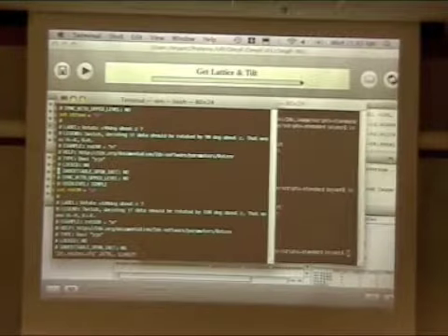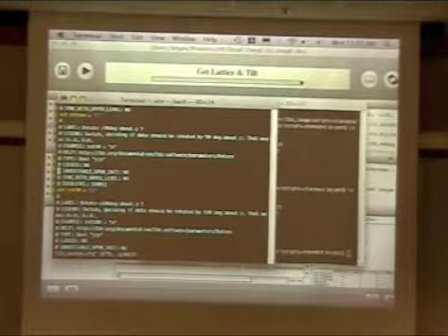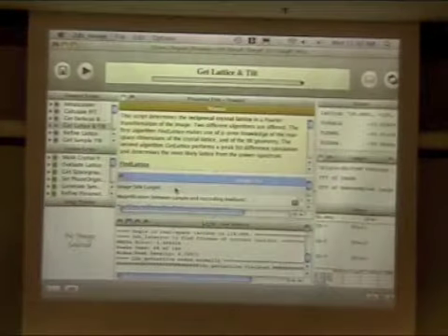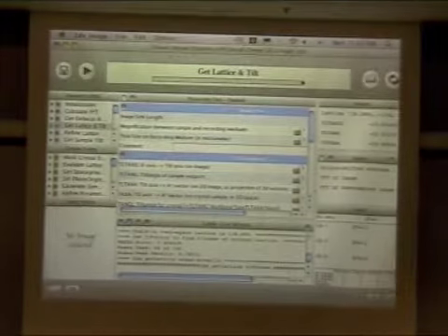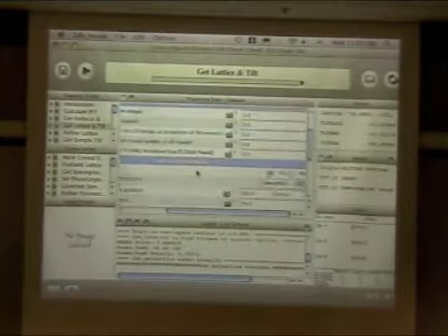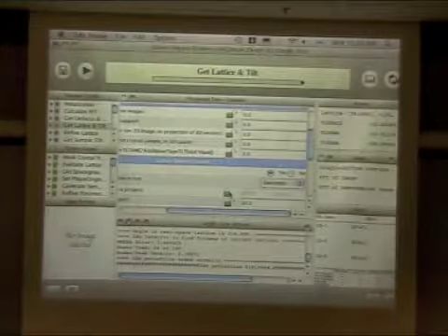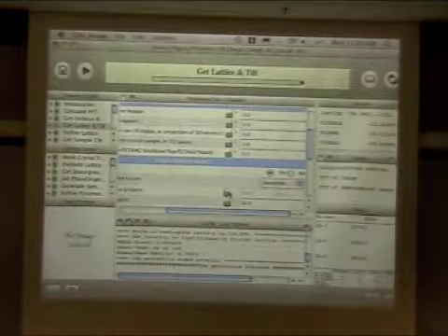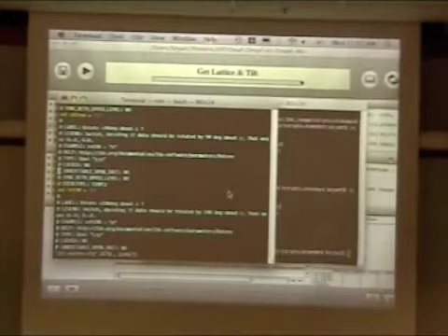Whether it's lockable, meaning can you tell it to lock when you see it in 2DX, basically says not the user, not even a script can update these values. So for instance, we had just determined, say, a real unit cell, and we never wanted that touched again. We could block that, and neither a user nor the scripts could then go in. And that's, again, all there in the configuration file.